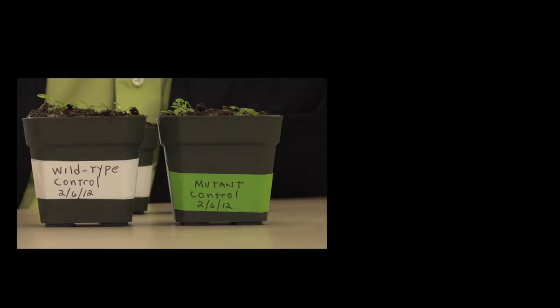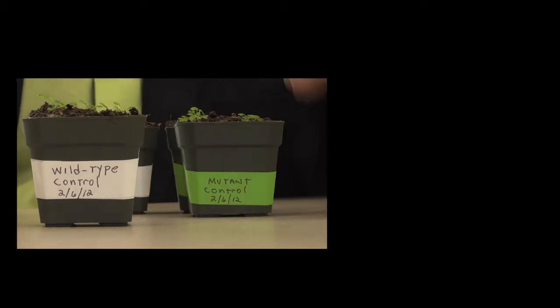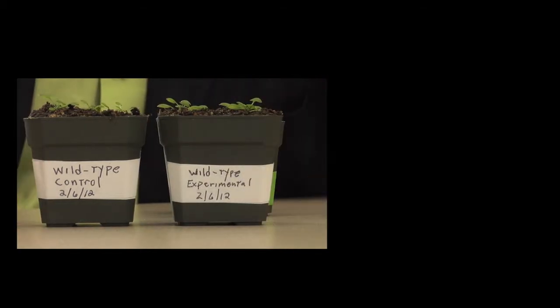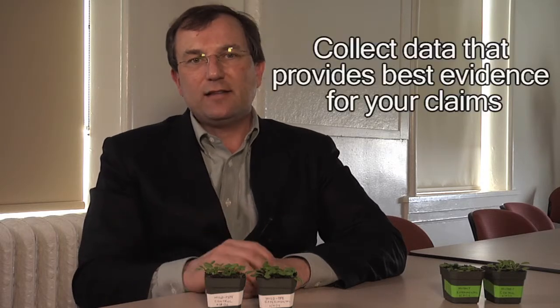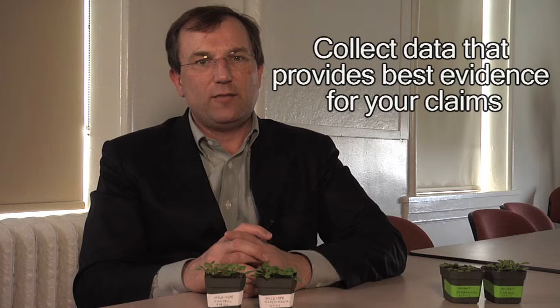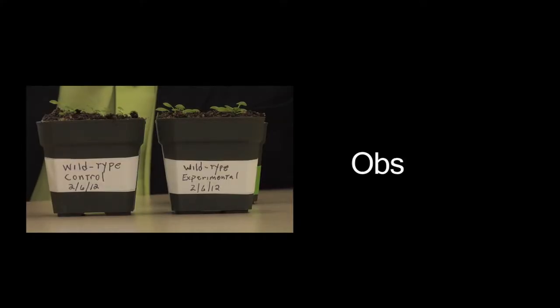Now let's look at the effects of the environmental change by itself. To do that, I'm going to put the wild-type control pot right next to the wild-type experimental pot. When I do this, I'm trying to answer the question, what are the effects of changing the environment? Remember, I haven't changed the genes in these groups. Both pots contain wild-type plants. I just want to see the effects of the environmental change by itself. Again, record your observations and try to collect the data that provides the best evidence for your claims. And again, put the 2 pots side by side like this and take a photo of them and write your observations right next to the photo.